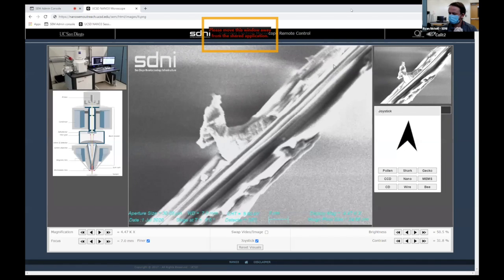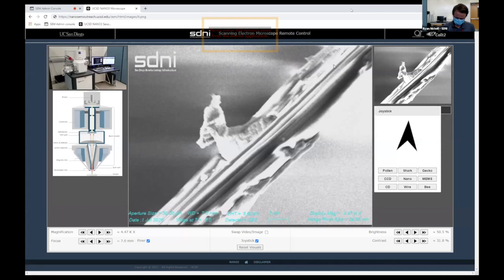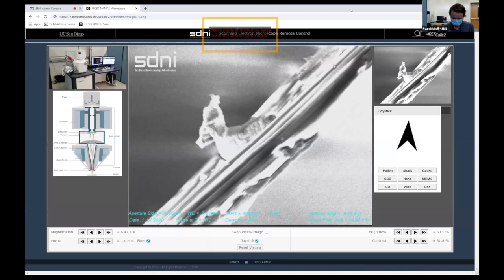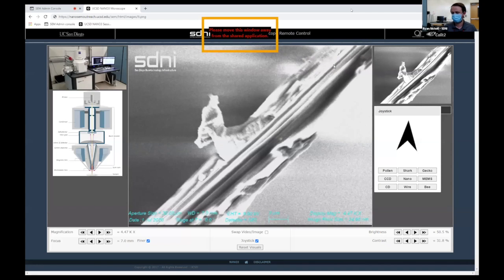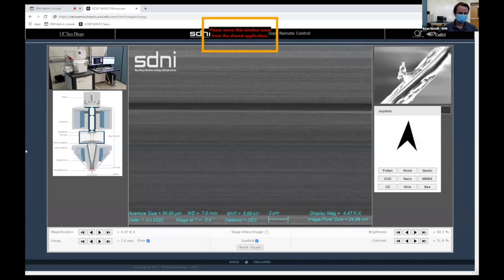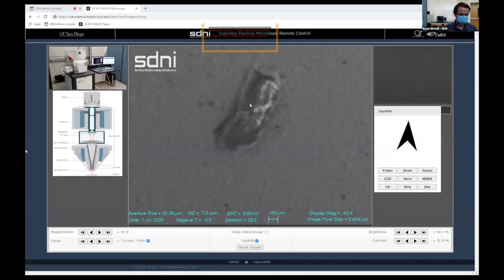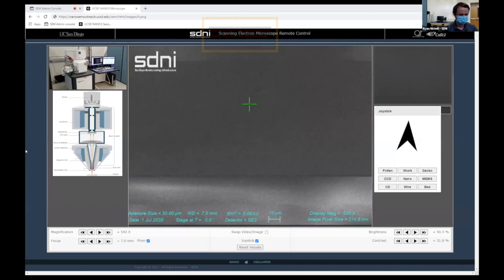Yeah, this tool is used by many types of people, like different types of researchers. So it's very broad. People from organic medicine, electrical engineering, material science, chemistry, physics, applied physics, all sorts of types of groups or researchers would be working on this type of tool. And actually, the other tool that we'll take a look at as well. So what's nice is that these sets of tools can be used to characterize many different things. You just have to pick the right tool for what you're trying to look for and things like that.